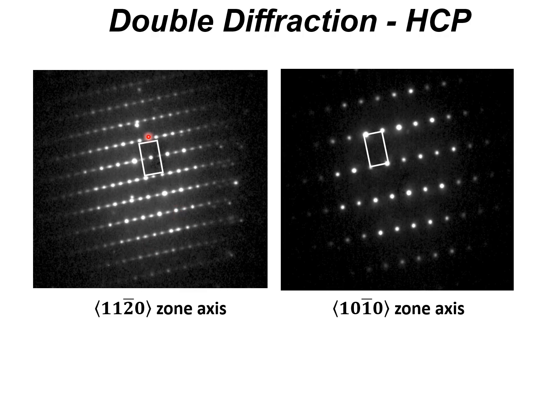In some circumstances, you get these extra spots where they shouldn't exist based on the structure factor. So just be aware of it.